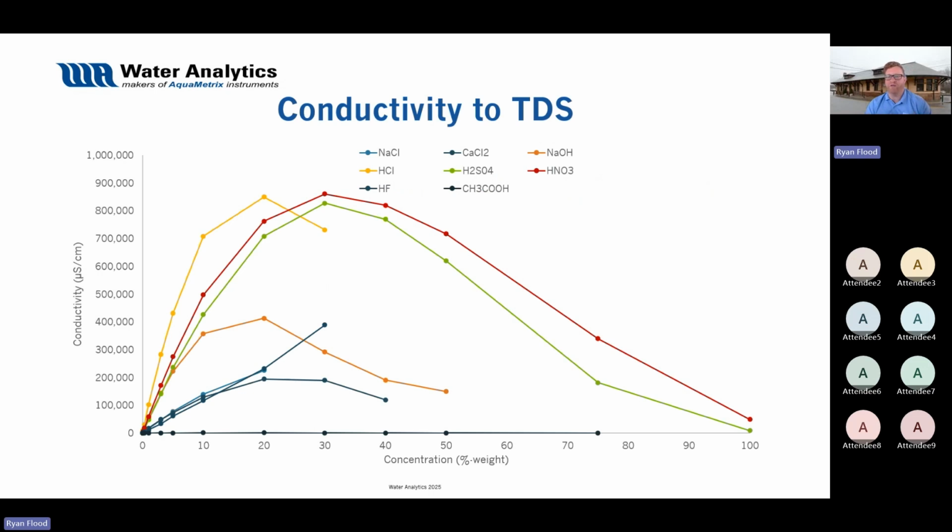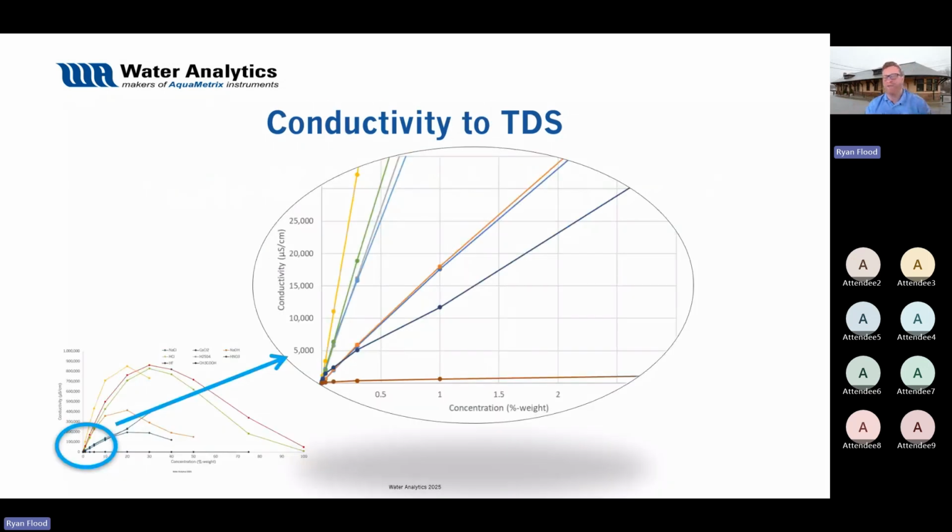So what does that mean to you guys? Do you need to know all these details? Not necessarily. It comes down to the equation and calculation for conductivity to TDS. If you see something like this, you might start to get a little nervous and say this is more complicated than I want. Well, we want to simplify things for you today.